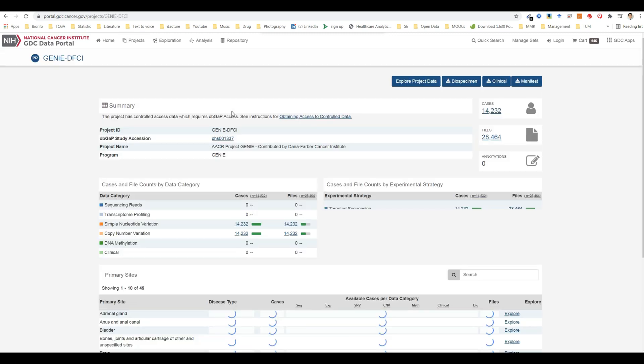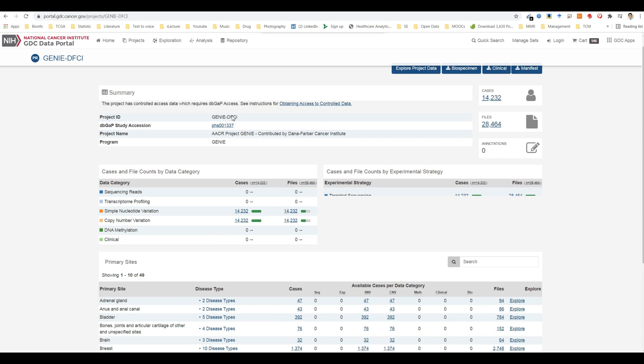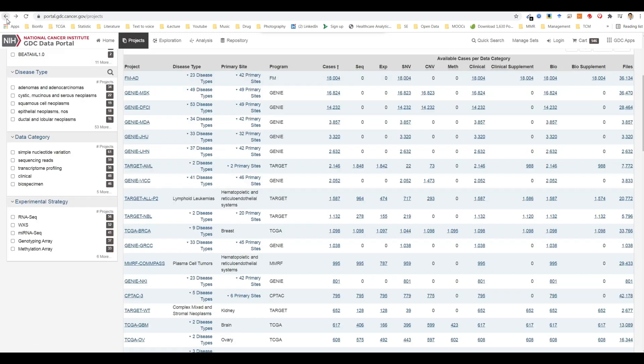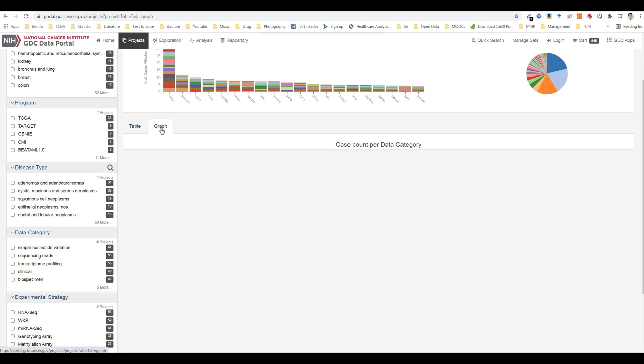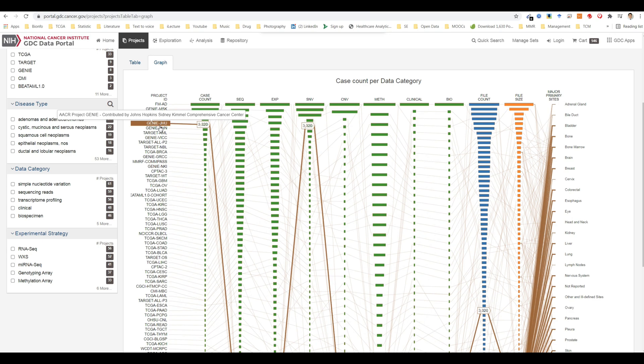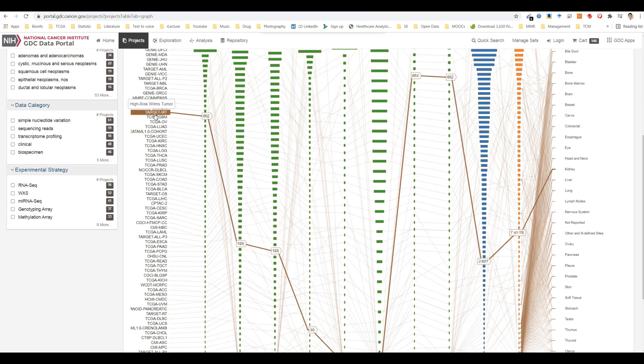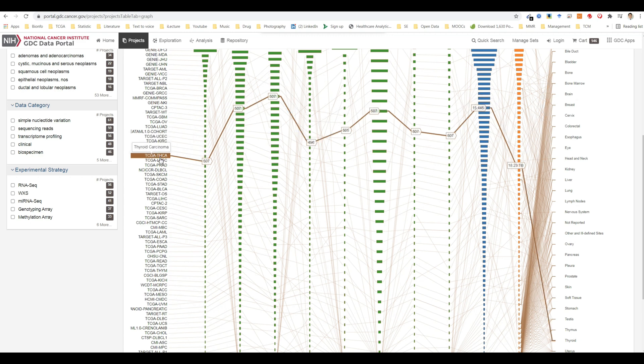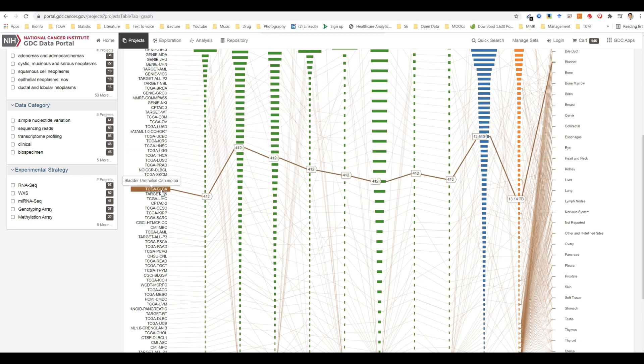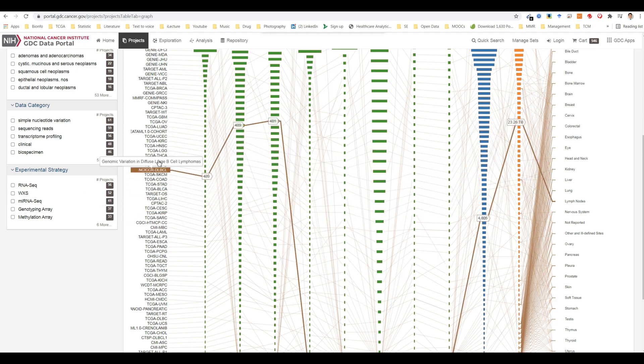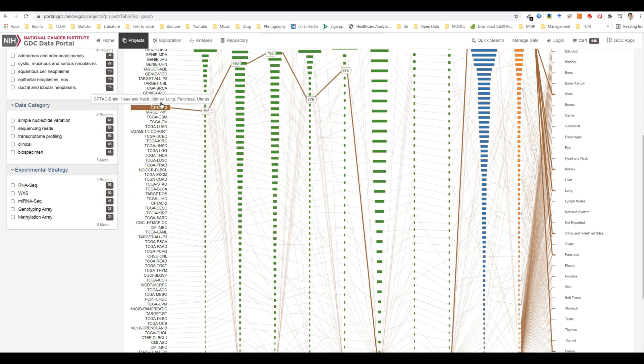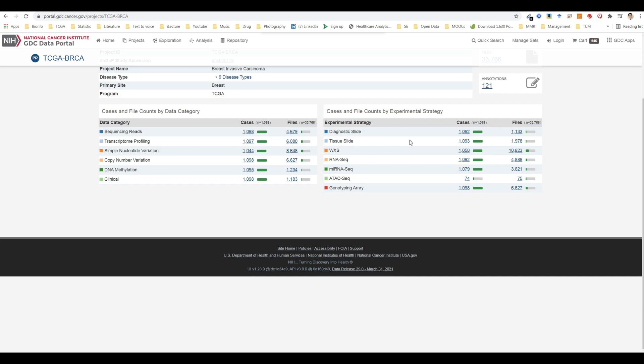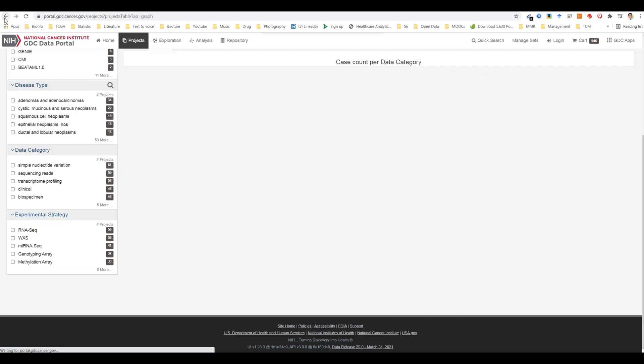The graph tab contains an interactive view of information in the table tab. The numerical values in case count, file count, and file size columns are represented by bars of varying length according to size. These columns are sorted independently in descending order. Mousing over an element of the graph connects it to associated elements in other columns, including project ID and major primary sites. Most elements in the graph are clickable, allowing the user to open the associated cases or files in the repository page.